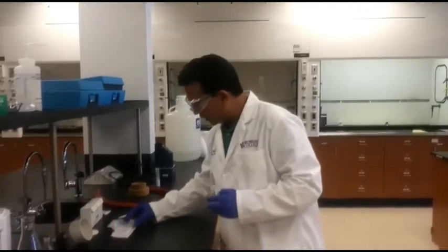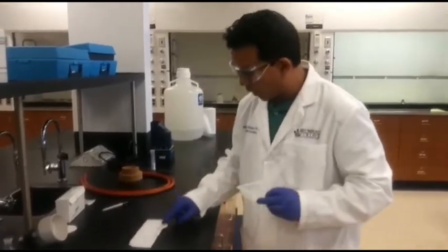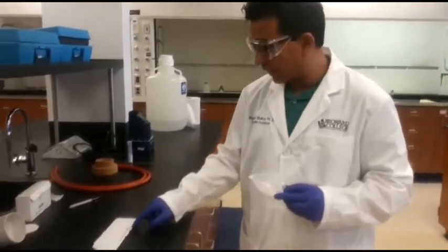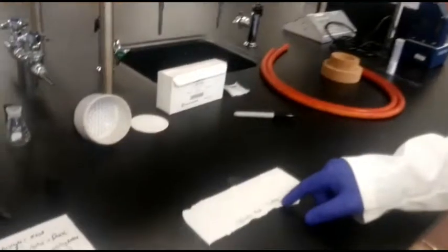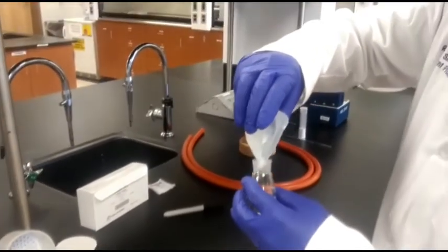I have weighed the salicylic acid here on the weighing board. It is 1.001 gram, and I have recorded the mass here, so you can take a note of that, 1.001 gram. So this salicylic acid I will use here in this Erlenmeyer flask first.